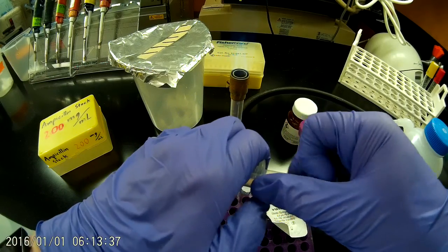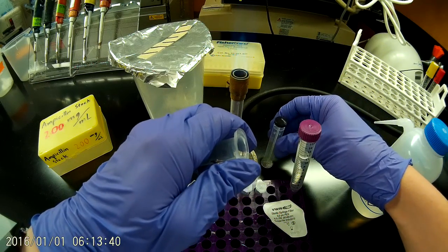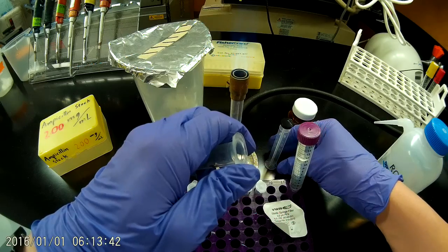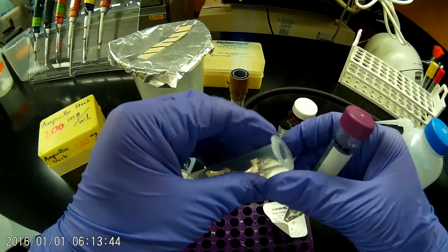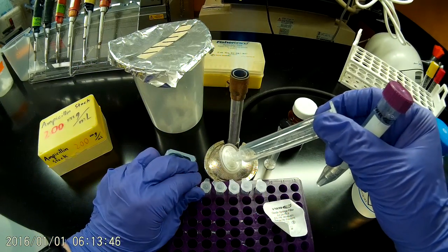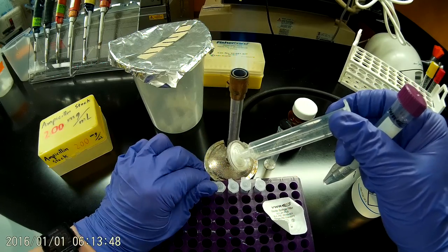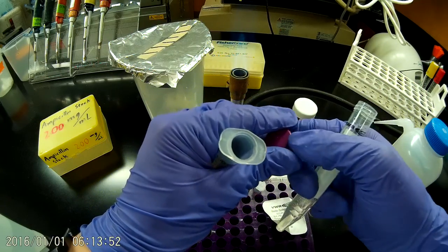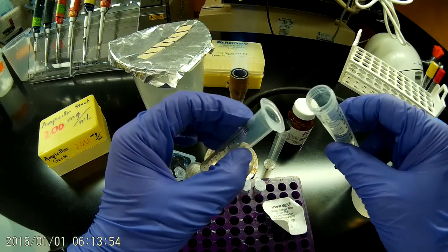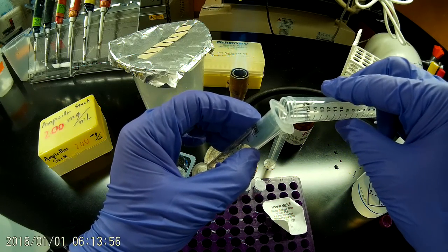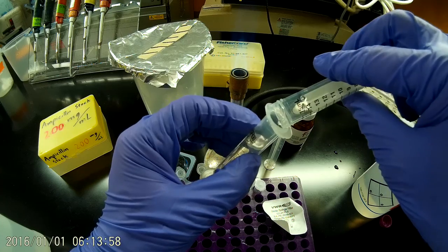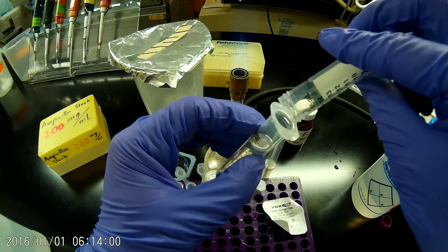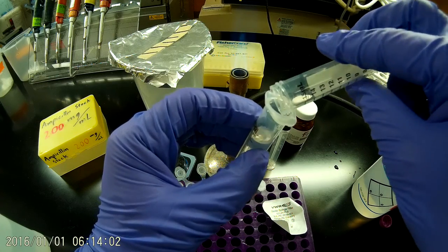Now I'll pull out the plunger, set that aside, and then I will drop that cap aside, and then I'll just pour my ampicillin solution into the syringe.